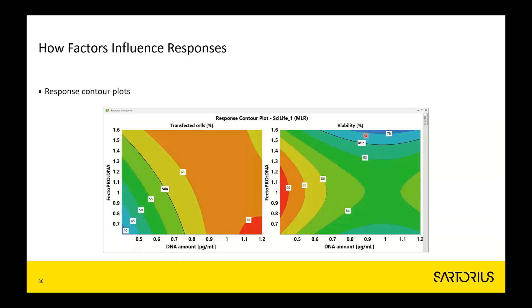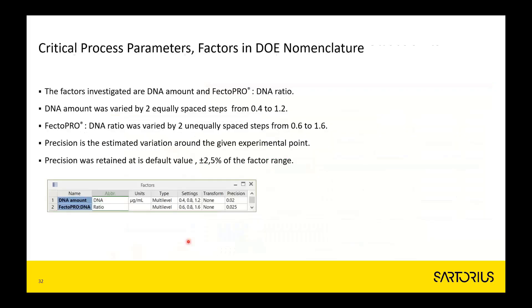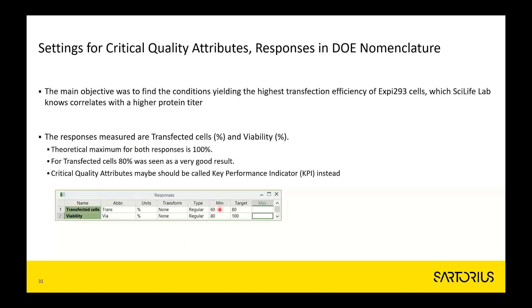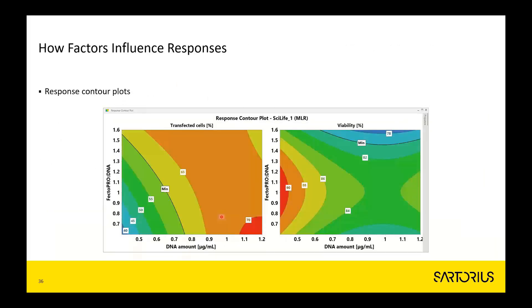Response contour plots are easier to interpret. On the left is the plot for transfected cells and on the right is the plot for viability, showing how these two responses are predicted to change when the ratio of FectoPRO to DNA and the DNA amount are varied. The minimum specification levels are emphasized with thicker lines: transfected cells should be above 60 and viability above 80. Highest viability appears in the left-hand part while highest transfected cells is in a different region — they are conflicting.